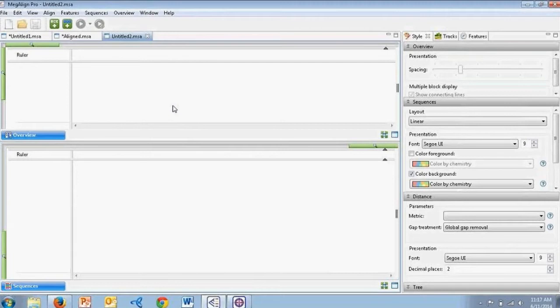If you simply added these sequences as we did in the previous workflow, you're going to end up aligning these parts to one another. Instead, we need to enter the sequences using a different method to make sure the entire set of sequences in the multi-segment file will be treated as an end-to-end concatenation instead of aligning all of these parts to each other.